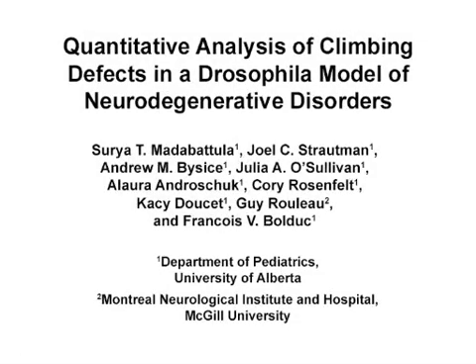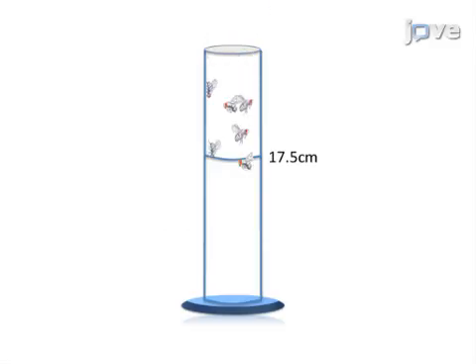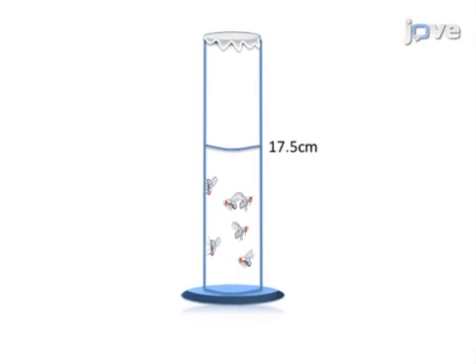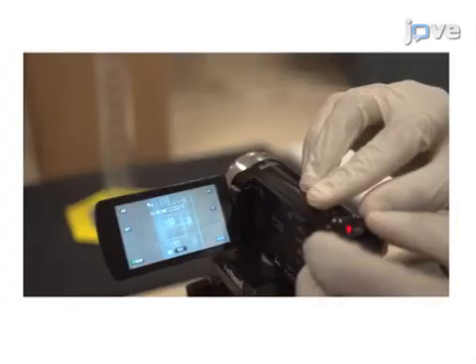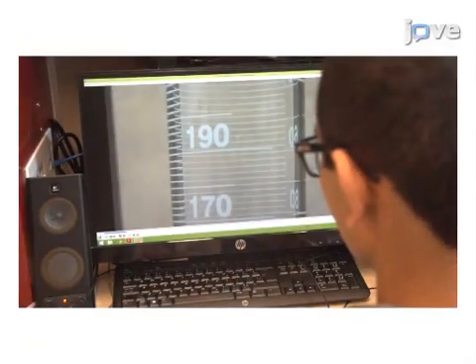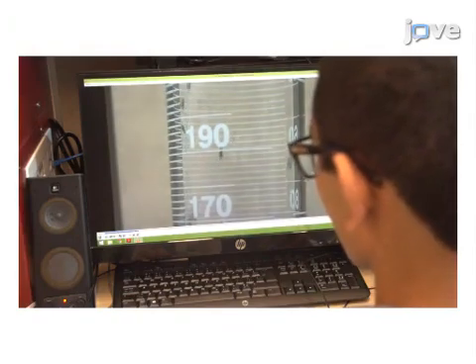The overall goal of this procedure is to quantify the climbing ability of wild-type flies and flies mutant for genes involved in locomotion. This is accomplished by first transferring the flies into a glass-graduated cylinder. The second step is to displace the flies to the bottom of the cylinder by lightly tapping the cylinder on foam padding. Next, flies crossing the target line are recorded using a video camera for a duration of 2 minutes. The final step is to analyze the videos and plot the number of flies above the target line every 10 seconds.